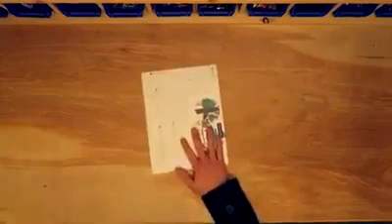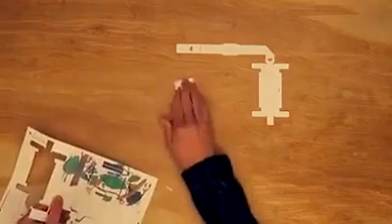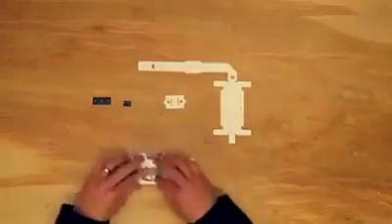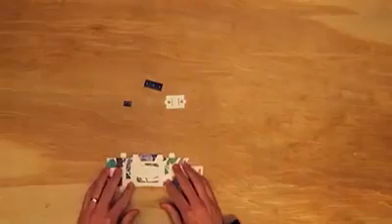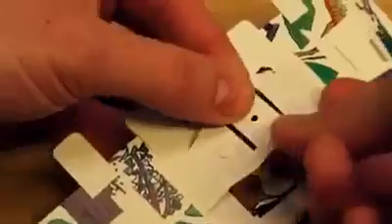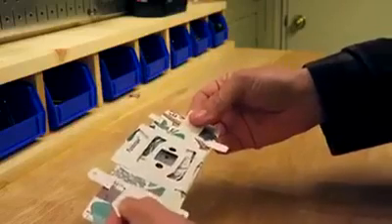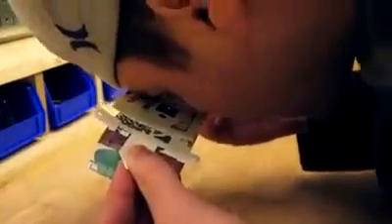Now let me support that statement by showing you how this 50-cent paper microscope actually works. It comes like this, and then you pop out the pieces of paper, and then follow the simple instructions like folding origami. The lens is actually a tiny sphere of glass embedded in this plastic. You can put your slide in here, and then you look through that tiny glass sphere, and it's magnified 140 times. You can even put your phone up to it and film and capture video like this.